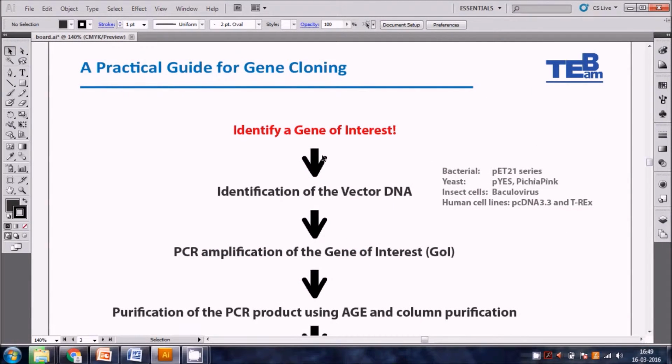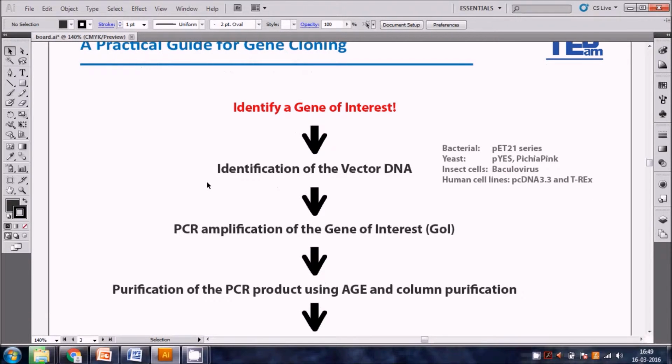Hello guys, I'm creating this video just to give you a kind of capsule for the practical guide for gene cloning, and then it will be very easy for you to understand all the next steps. So we will start from the identification of a gene of interest.